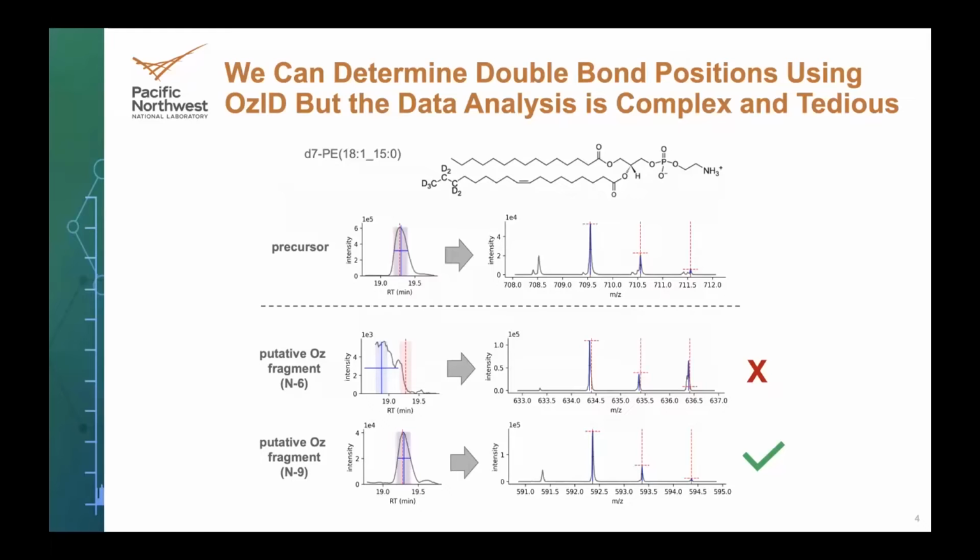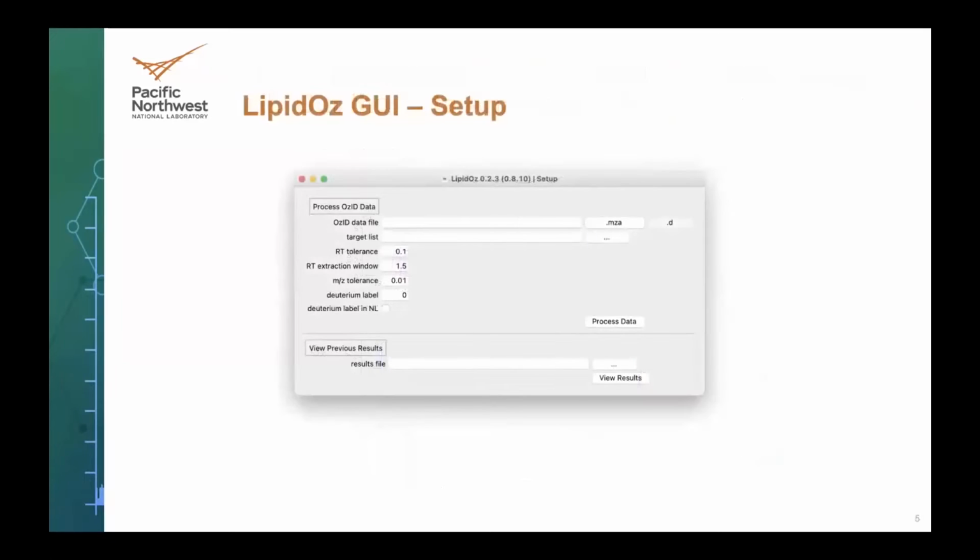And so we have both a Python API for being able to monkey around with this and do custom workflows to your needs. But we also package this into a standalone GUI application, which I'll just quickly run through a little demo of how it looks using it. So it starts up with this screen. It's our setup screen.